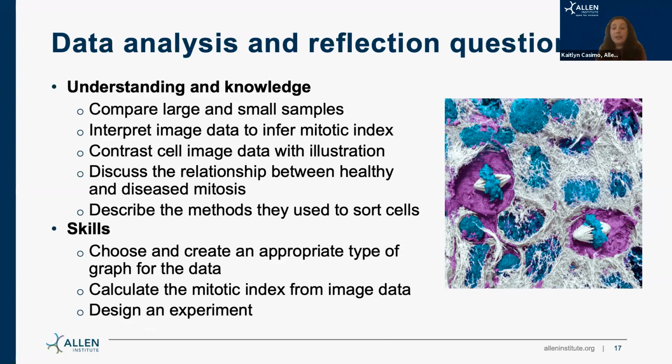For students learning statistics, it helps reinforce the concept of small versus large sample sizes as well, because they're going to look at their own data, 25 cells, versus the class data, potentially hundreds of cells. They're also asked to design another experiment that applies the type of data that they just used. And these questions can either be done alone or in small groups. If they've been working together to collect data, they might continue working together.